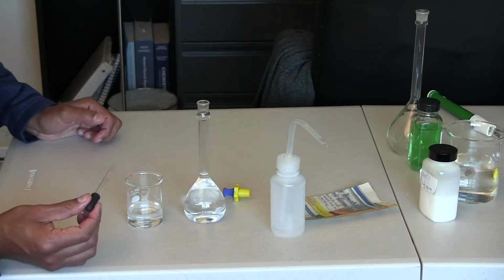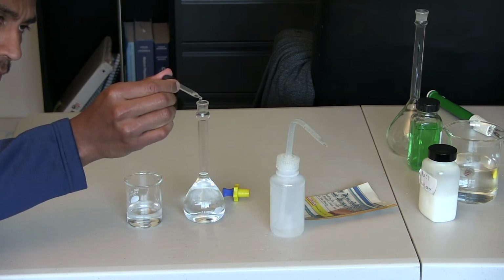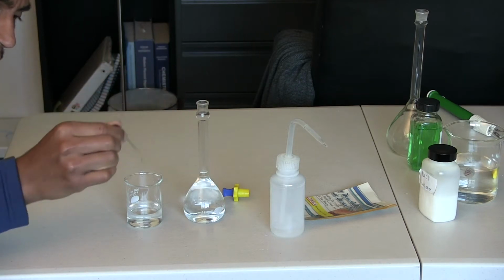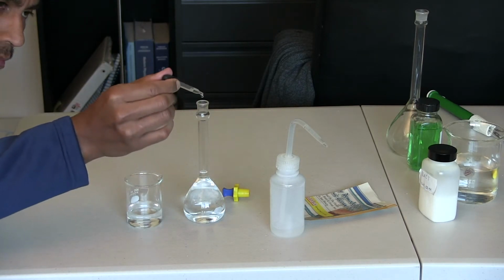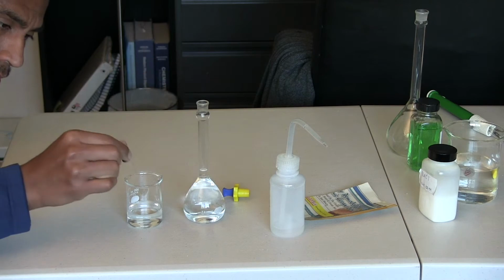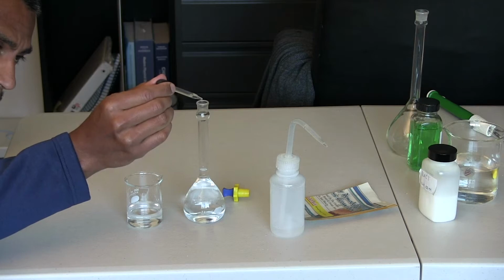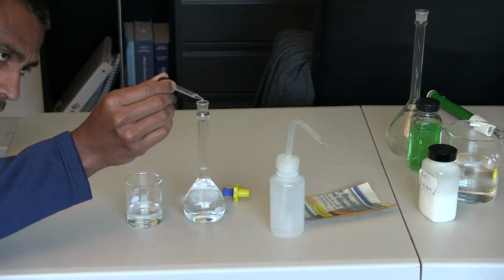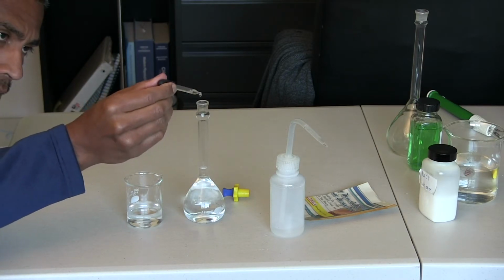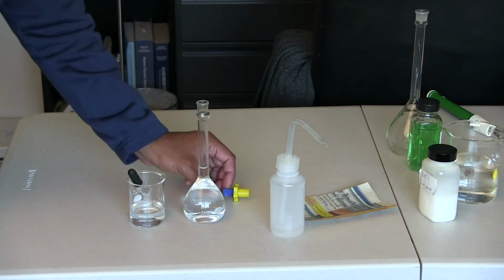Now I want to make sure I'm at eye level with the mark. Okay, so the meniscus is touching the mark now.